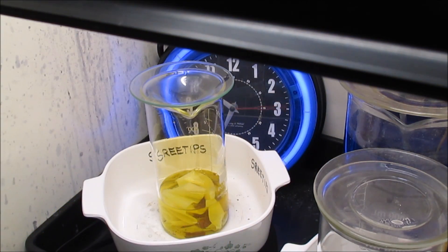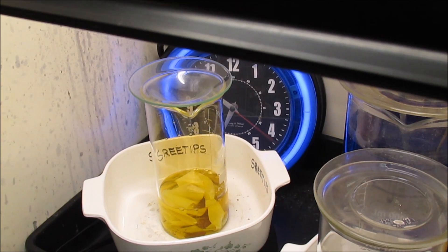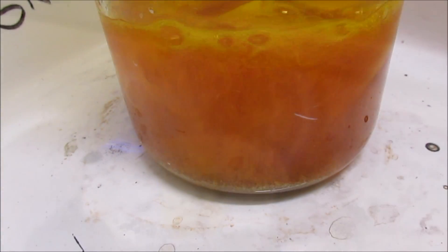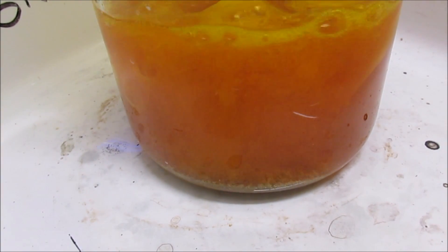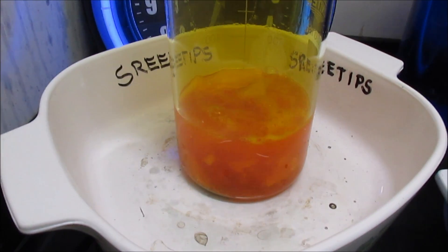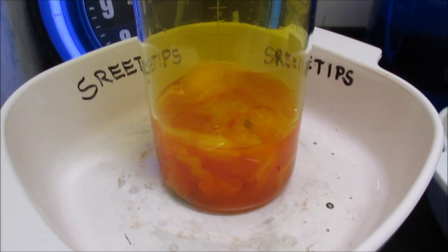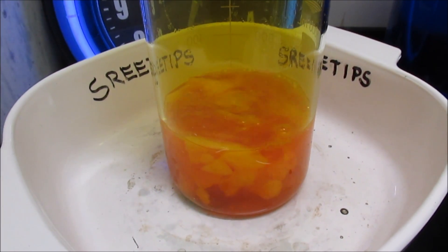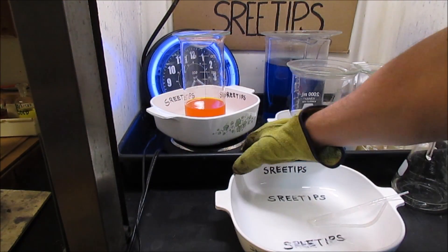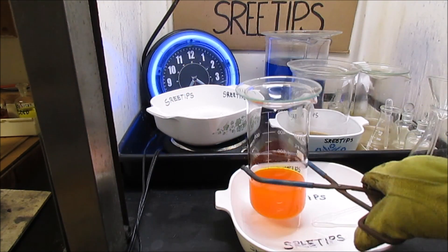I'll go ahead and put the sulfuric acid in now — just about 1ml — as a precaution to precipitate out any lead that might be in there. Notice how the filter paper just falls apart, and that will aid us when we cool this down and run it through another filter — it will help filter any really fine stuff out of the chloroauric acid solution. The gold has been on the heat now less than an hour, and everything has gone into solution with just 12ml of nitric acid. I'm going to pull it out and let it cool off.